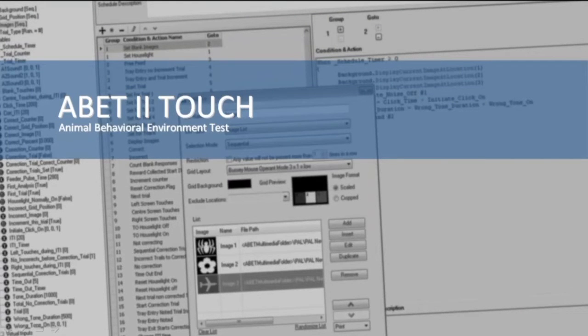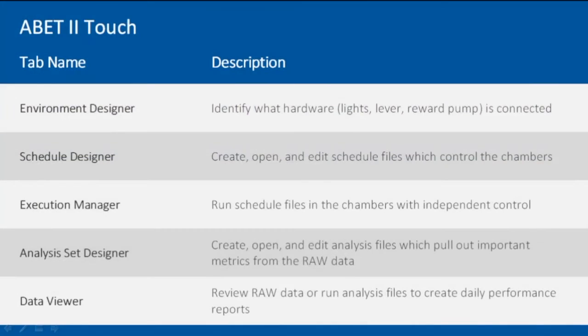Switching over to the software, the main software component which controls the touchscreen is called ABET2 Touch, produced by Lafayette Instrument. For a quick overview, we have 5 main tabs or sections in the software. These are located on the left-hand side of this table with a brief description of what they do on the right-hand side. Now we'll touch on each of these rather quickly, and while I may go a bit rapidly through this section, please note that if you have any specific questions on any of the features or functions of the software, please don't hesitate to email Julie or I directly to answer any of your questions or concerns.